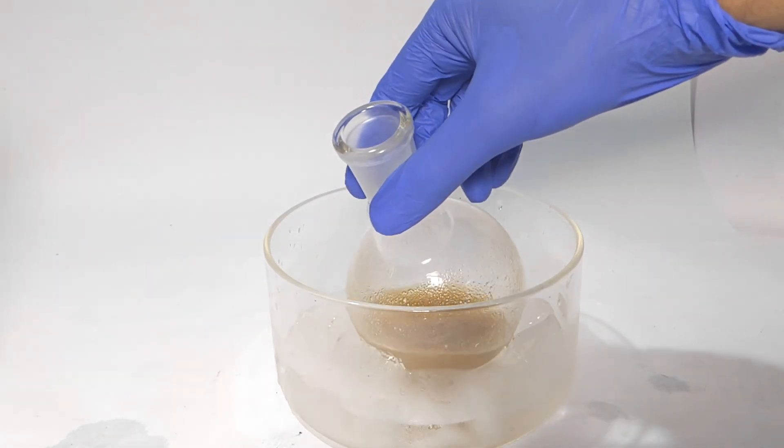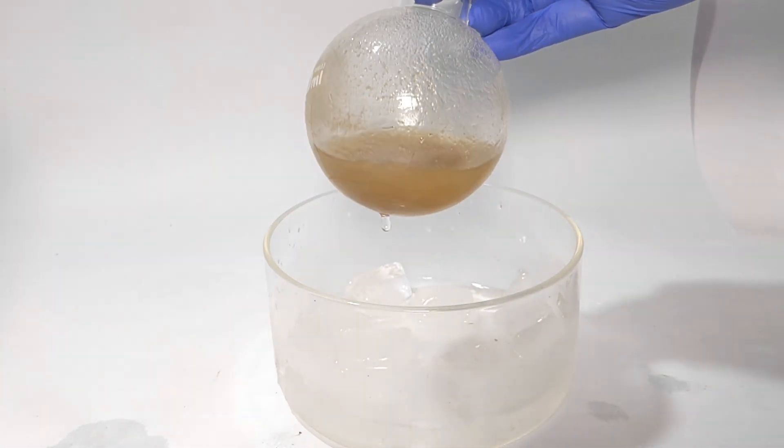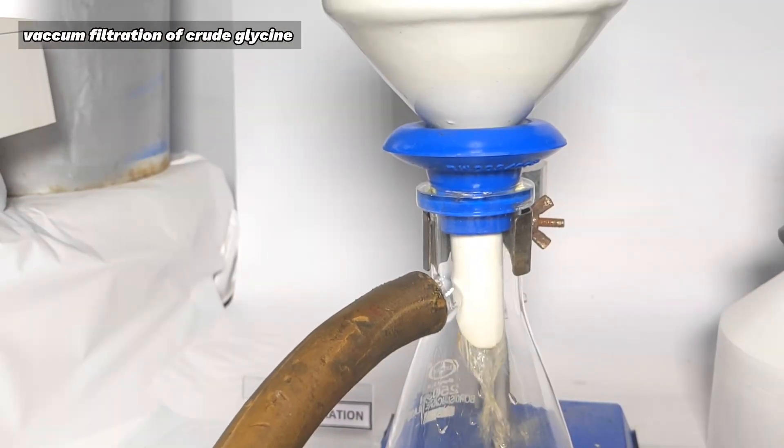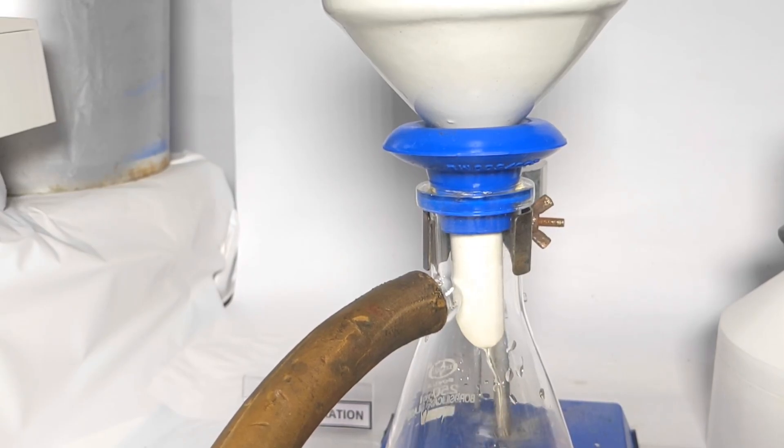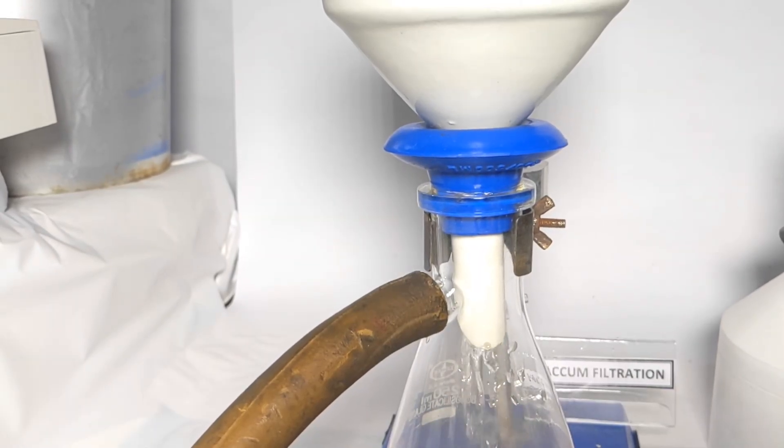This is the crude glycine which contains ammonium chloride as the chief impurity. The crystals were recovered by vacuum filtration. Methanol was used to wash the crude product in the Buchner funnel itself and this will remove most of the ammonium chloride impurity.